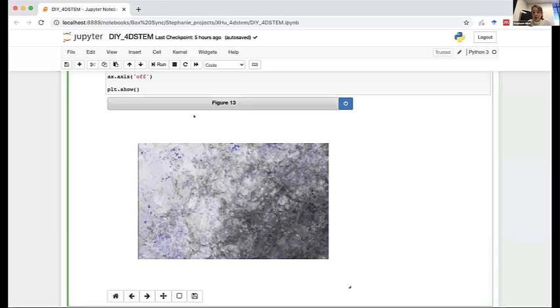My longest kernel in this notebook is about 90 seconds. Okay, yeah, that's good. And then I guess to add to that, we have prepared the data beforehand so you can run this faster. And as you can see here in Stephanie's demonstration, you do get a lot of information even after binning the original data.